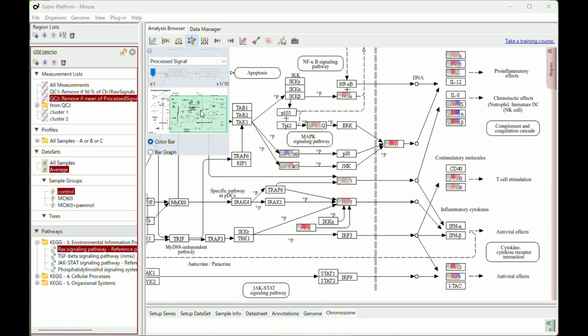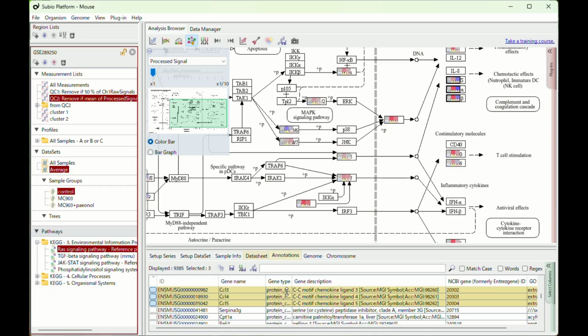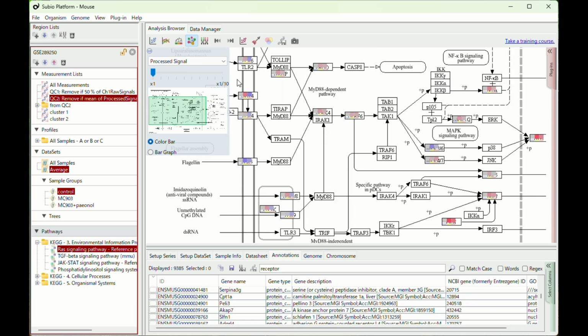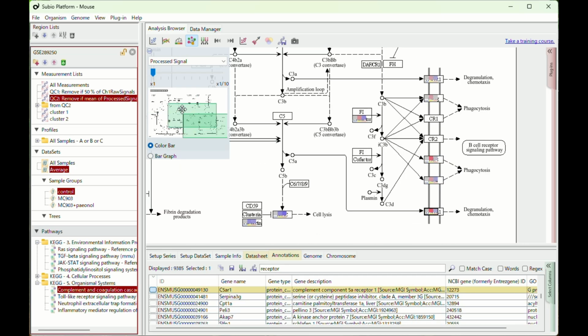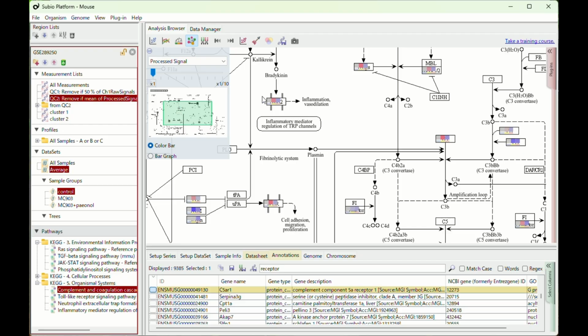In the pathway view, you can drag around elements to see what they are. Alternatively, you can highlight pathway elements using keyword searches. Or drag to select receptors on the cell surface to see what they are. Pathways often connect to neighboring pathways, allowing you to go further. You can jump from one pathway to another as long as you are interested.